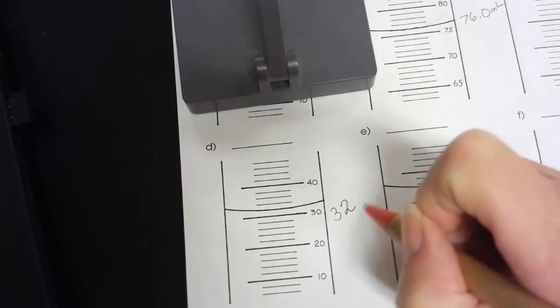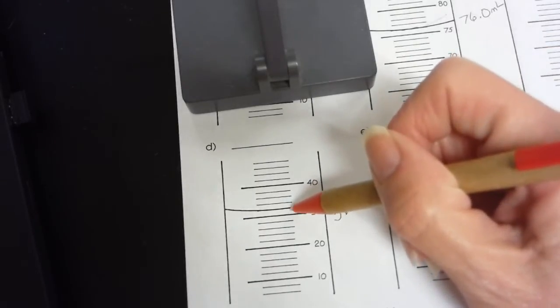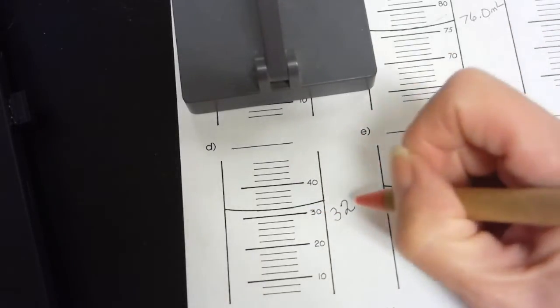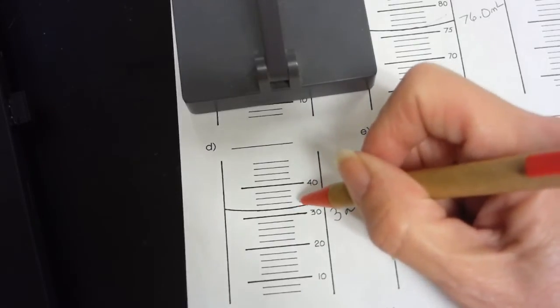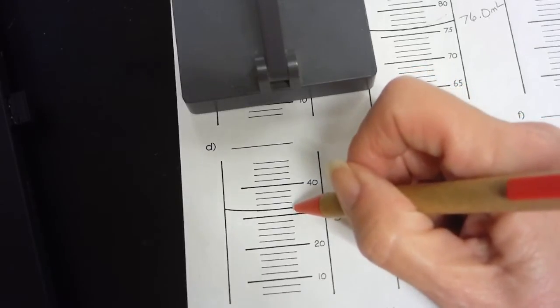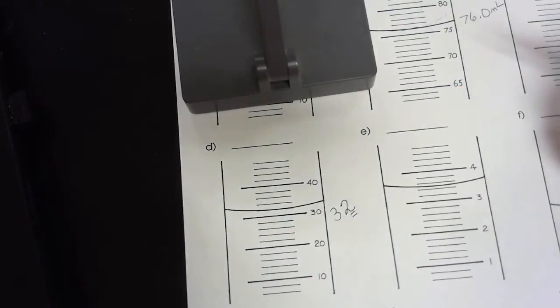And again, because these are in increments of 2, the range here could be anywhere from, like, 31.9 to 32.1 or something like that. So I'm going to report that one as 32.